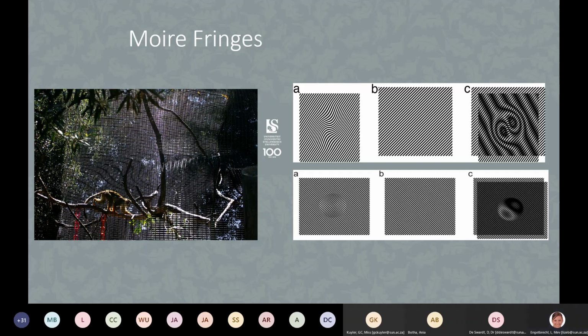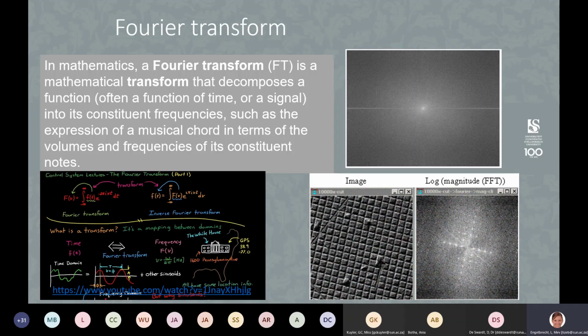So how does it work then in SIM? The processing part in SIM is to create a Fourier transform of your image where you've taken the images with a grid pattern over. I've taken out slides, I just realized.